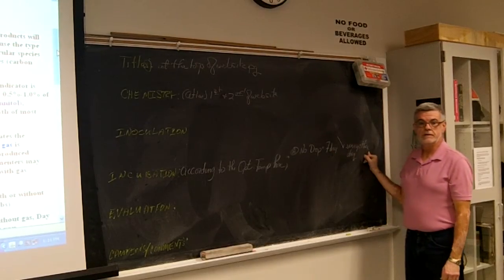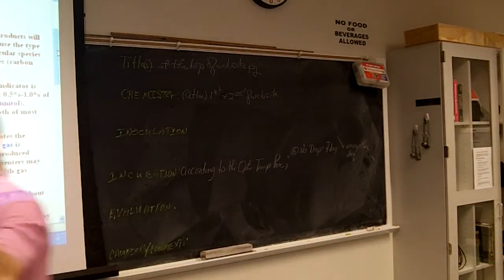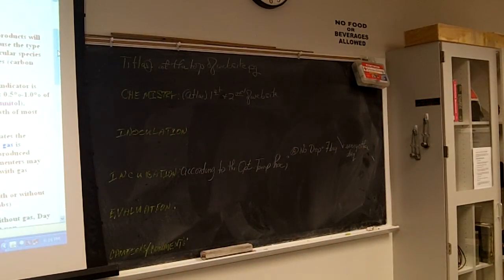Every other day. So in other words, you would inoculate it on Tuesday, and when you came back on Thursday, you would take it out, mix it, hold it up against white paper, and if it was yellow, you would write fast positive and discard, and you would look for a bubble or not on this one, remember? Yellow is positive.